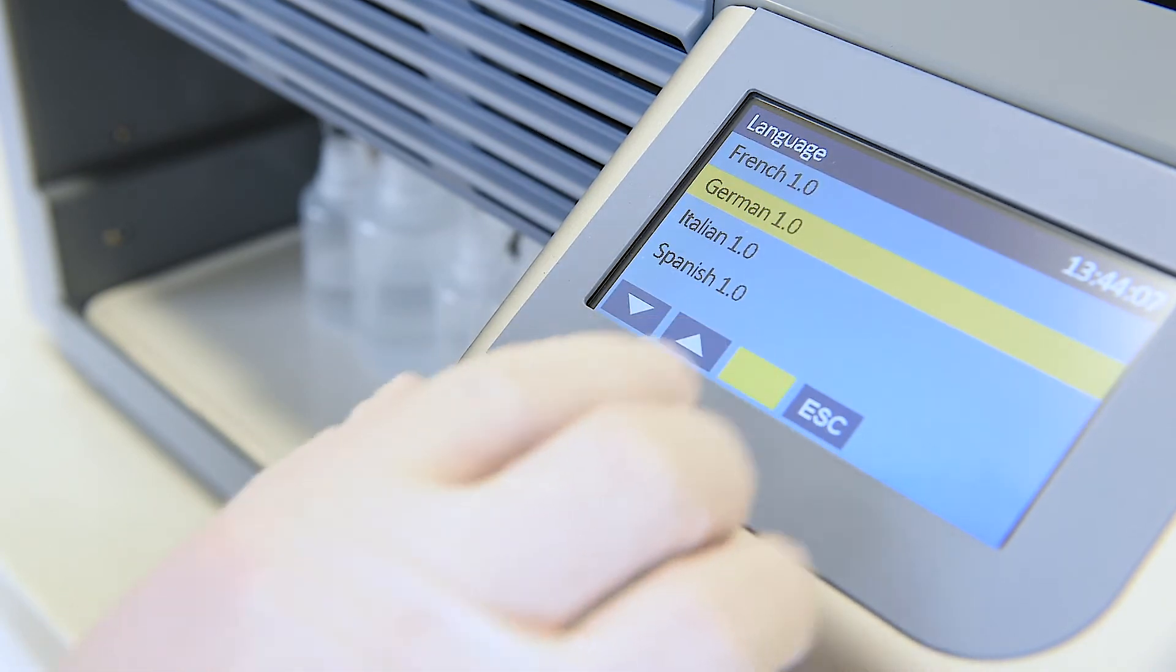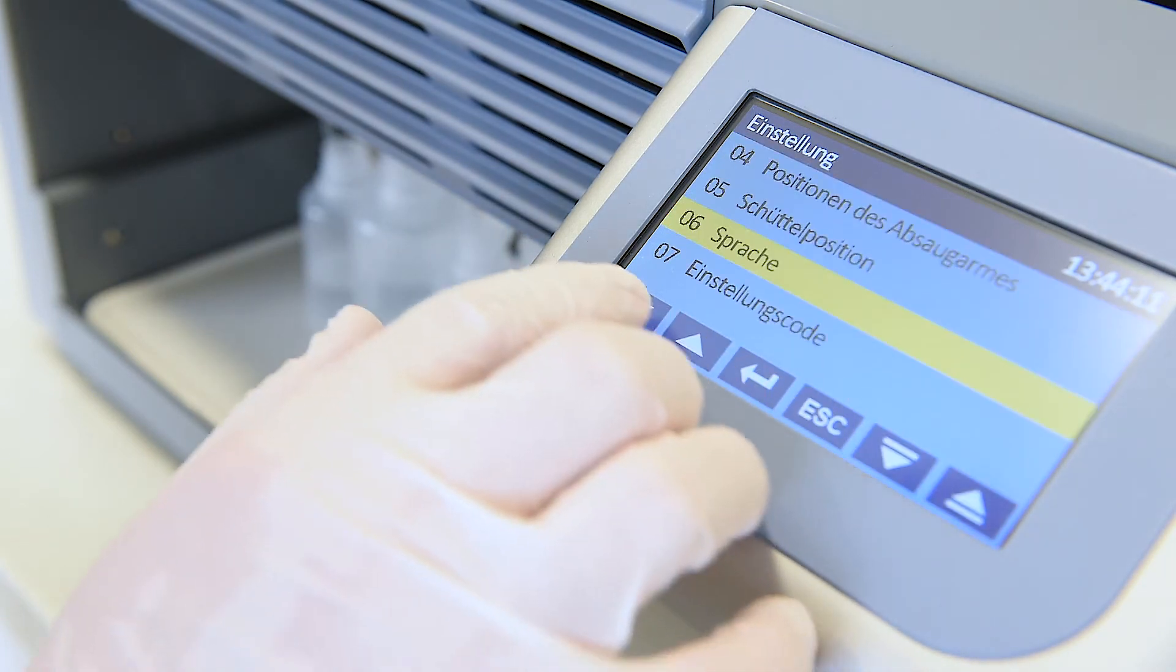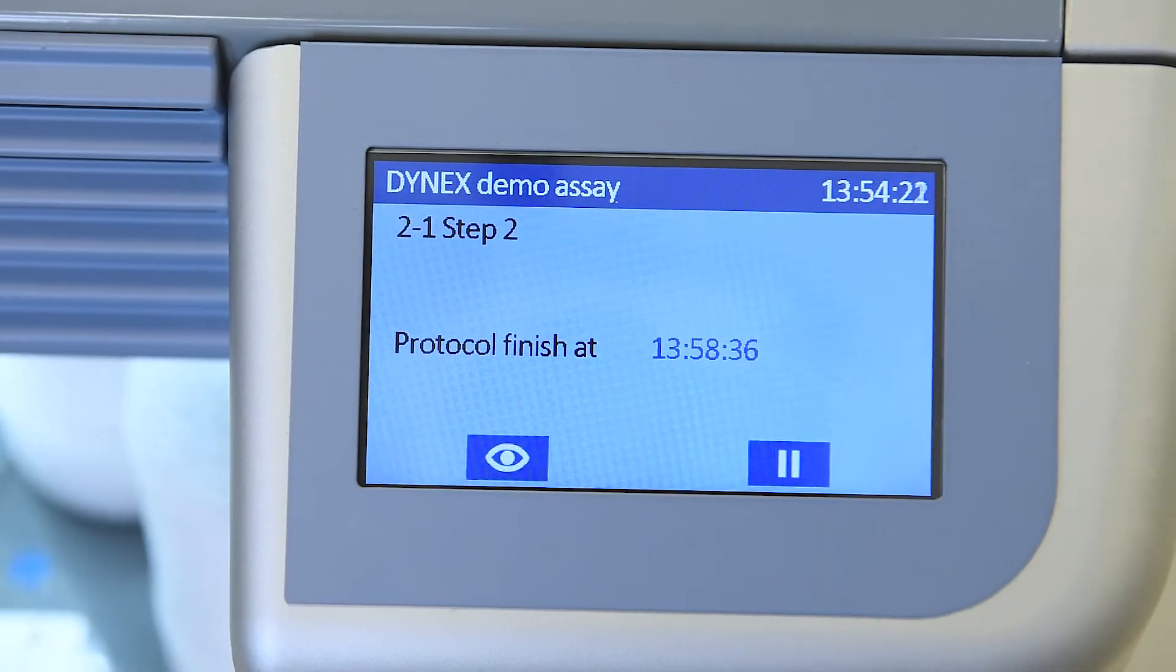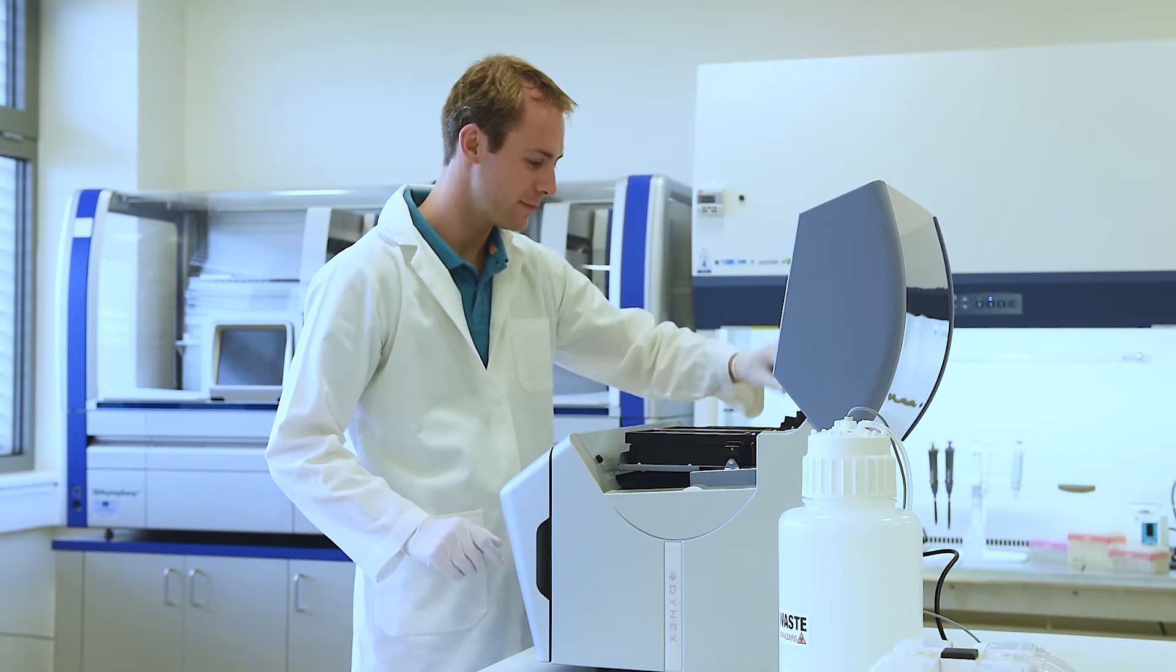The user can select a language version. The display guides the user during the preparation of the run, including reagents priming. It also provides information about run progress, like time to finish the run.